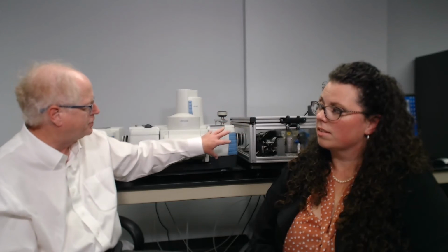The other accessory is a gas chromatograph accessory, so that you can have a gas chromatograph attached to a module that sits in between the GC and the infrared, and the gases emerging from the chromatograph pass through what's called a light pipe, and the IR beam reflects many times inside that light pipe, allowing us to detect moderately low levels, not as low as you can with a mass spec, but they're kind of in between there.